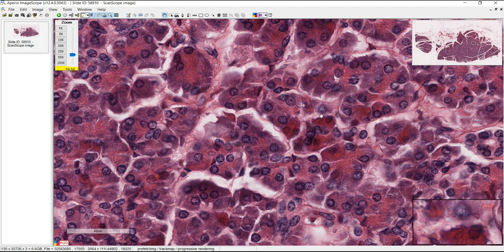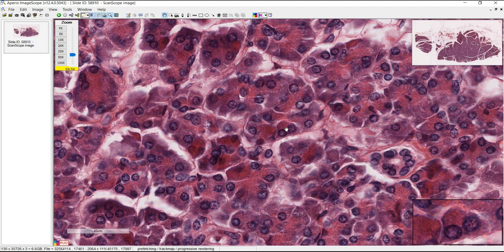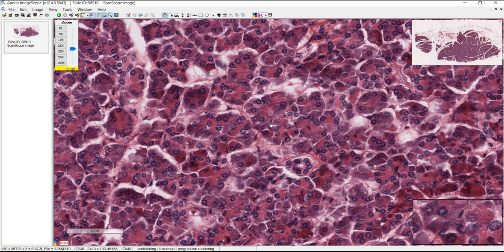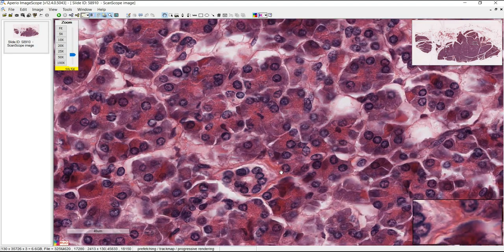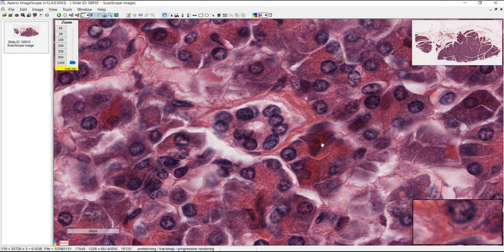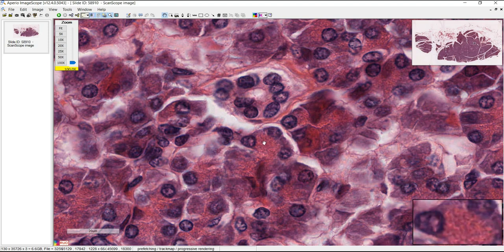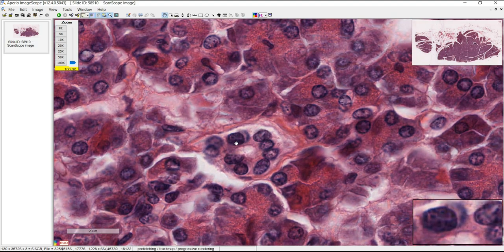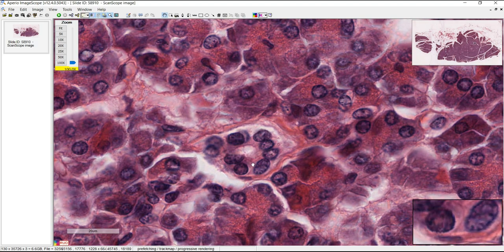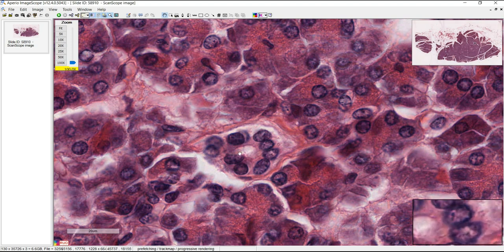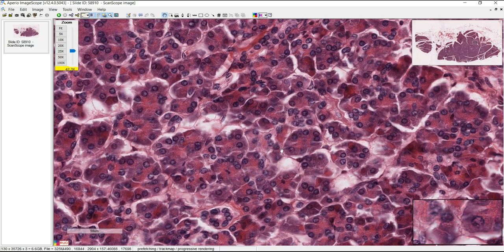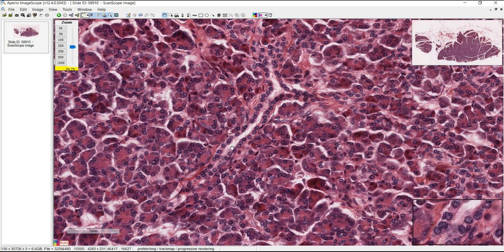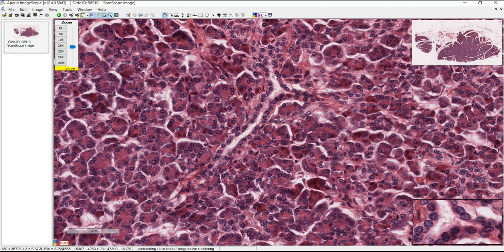Other than the serous acinus cells and the central acinar cells, there are also ducts. The ducts are going to be a little lighter staining, with less cytoplasm, and you won't see granules. For example, these look like acinar cells with tiny pink granules and lots of cytoplasm, but these others stain much lighter with less cytoplasm and no visible granules — this looks like the cross-section of a small intralobular duct, and this looks like a longitudinal section of an intralobular duct.